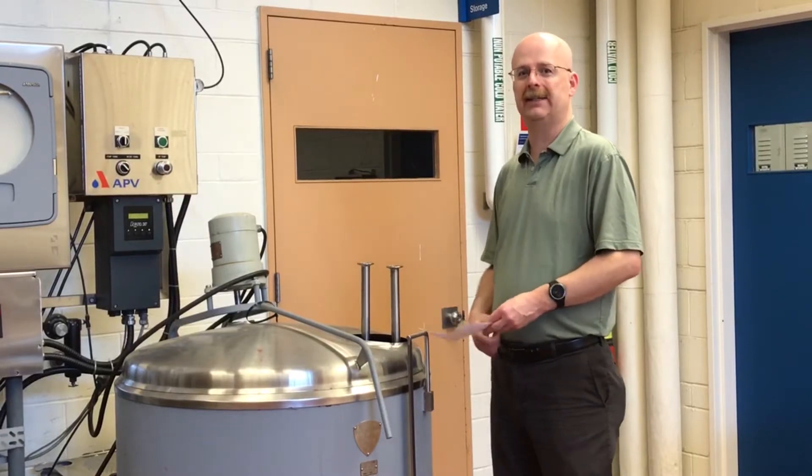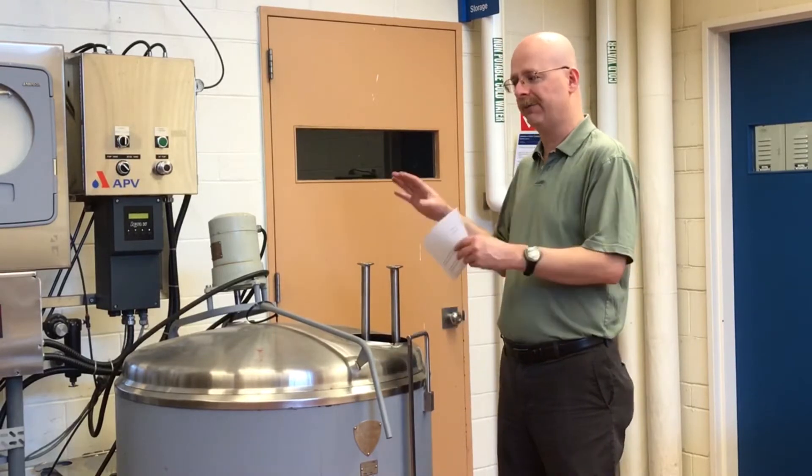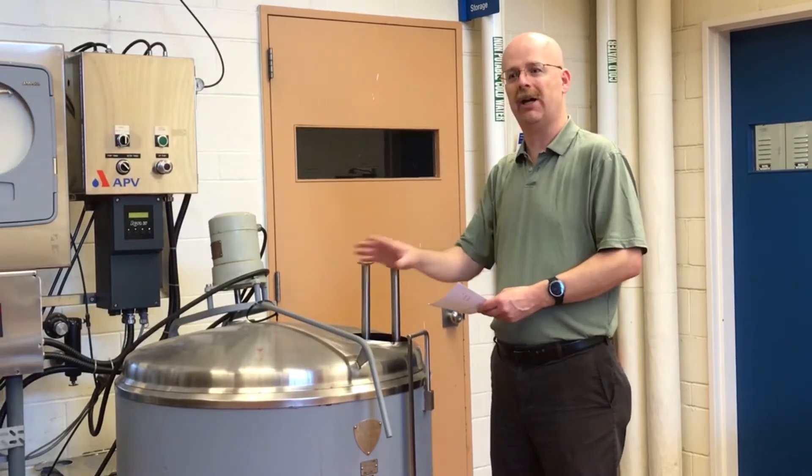Hi, I'm Ken and I'm going to be walking through our HTST system here at PCIT. We're going to be going through all the components of our HTST and following the flow of raw milk through our system until we have it pasteurized.